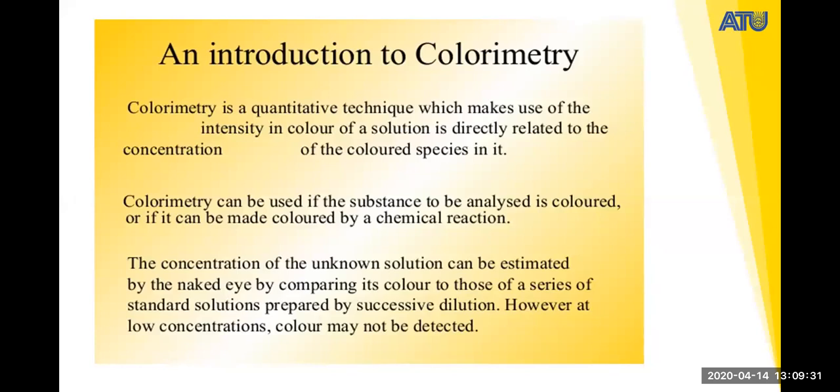The concentration of the unknown solution can be estimated by the naked eye by comparing its color to those of a series of standard solutions prepared by successive dilution. However, a low concentration color may not be detected.